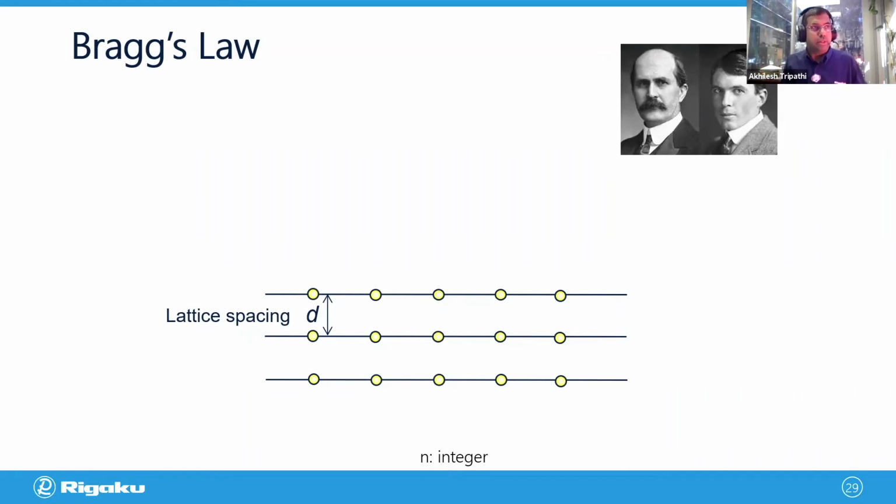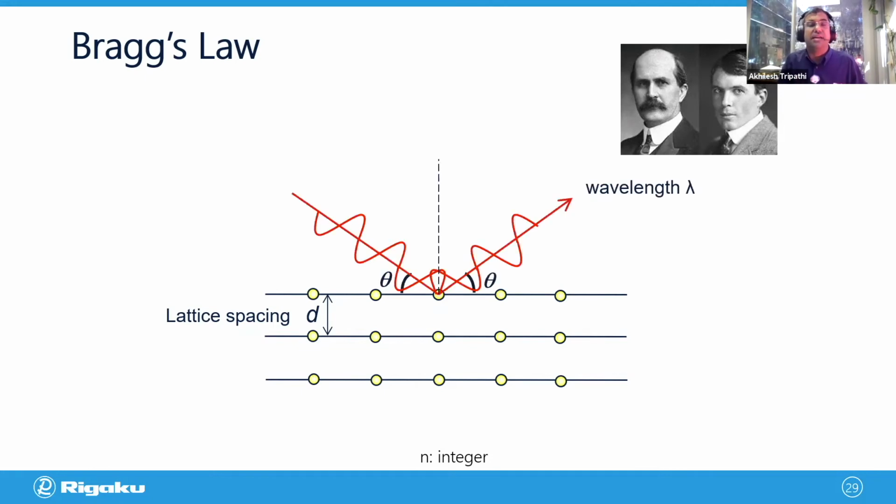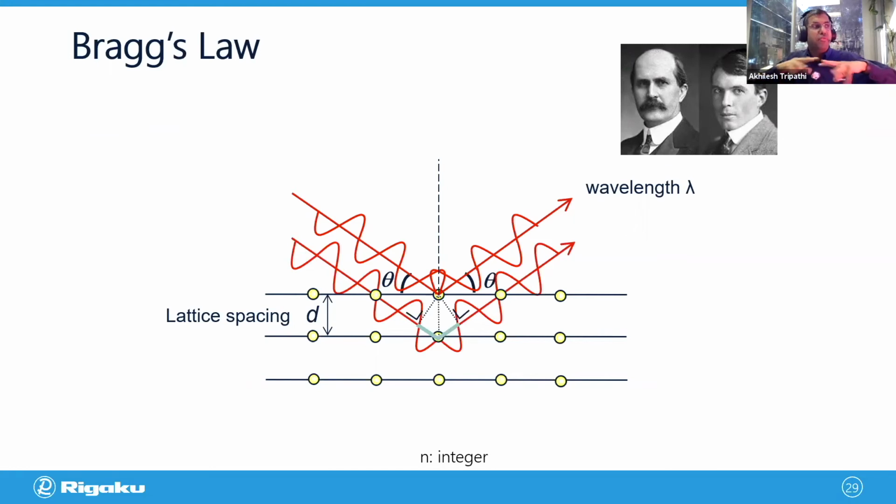So every material in this world, especially all the crystalline material, can be considered as consisting of layers of atoms, layers of atoms in some relation with each other. So this theory is very different than the XRF one. When we shine X-ray on it, what happens is it is diffracted, not reflected. It's following a law of diffraction. And we are paying homage to Dr. Bragg and his son. Both got Nobel Prize, actually, for enhancing this work, a father-son duo.